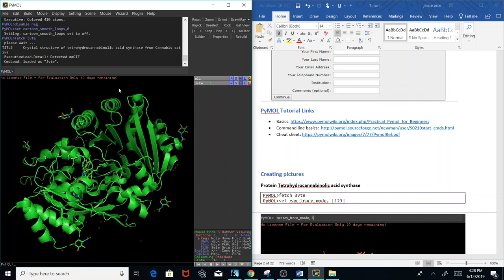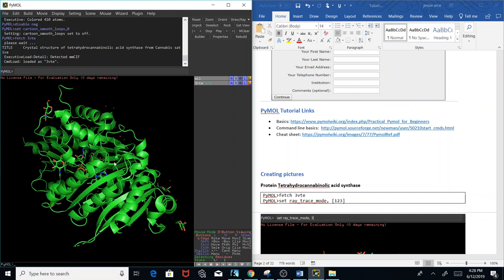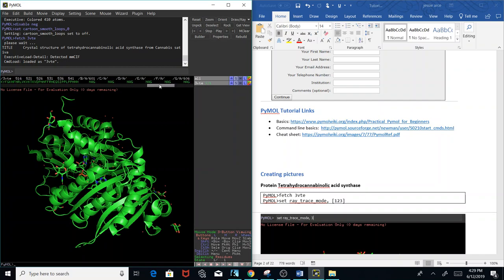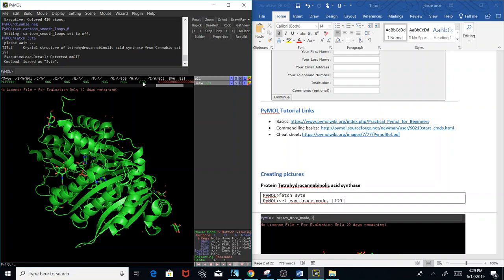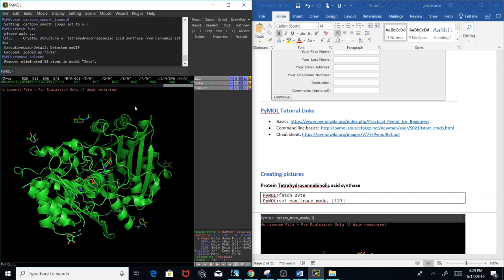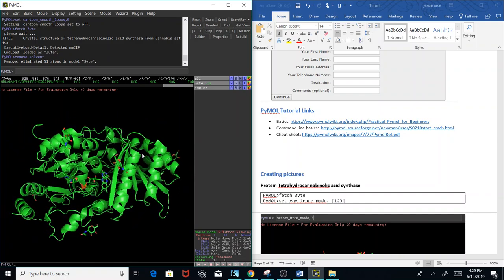Notice these red X's — those are waters. You can also see them on the sequence itself. Click on S at the bottom right and scroll all the way to the right to see ligands — the NAG ligand and the FAD ligand, which is the coenzyme. We can remove all these waters by typing 'remove solvent', and now the solvent is gone.